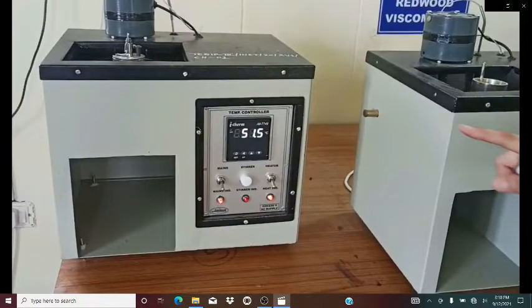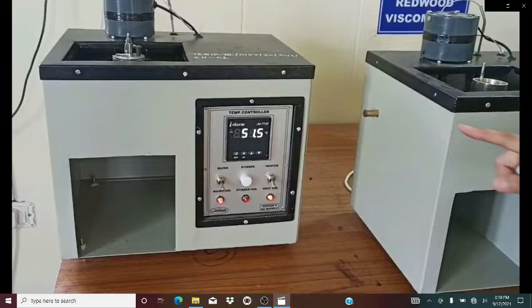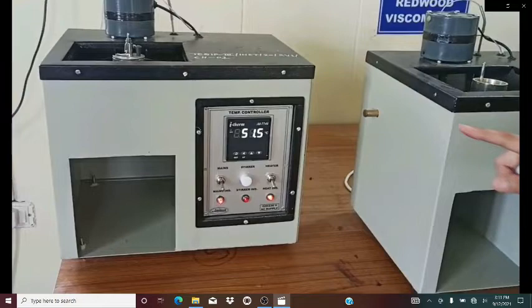Hello everyone, welcome to Spectrum Classes. This is another lab activity video. In this video we are going to perform another experiment. The aim of the experiment is to determine the viscosity of a lubricating oil by using a Redwood viscometer. Here you can see the instrument, and I will show you how to perform this experiment in the laboratory. Let's start.